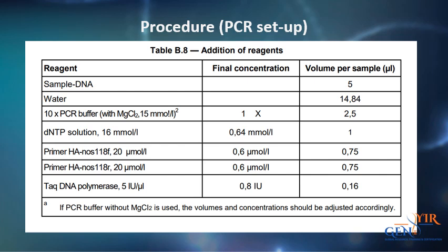A PCR reagent mixture is prepared to contain all components except for the sample DNA. The required total amount of the PCR reagent mixture prepared depends on the number of reactions to be performed, including at least one additional reaction as a pipetting reserve.